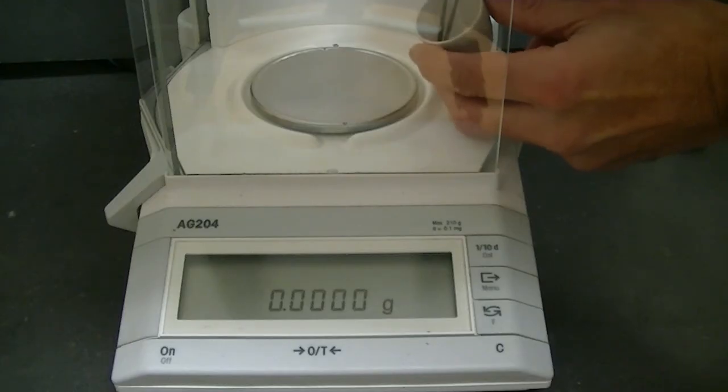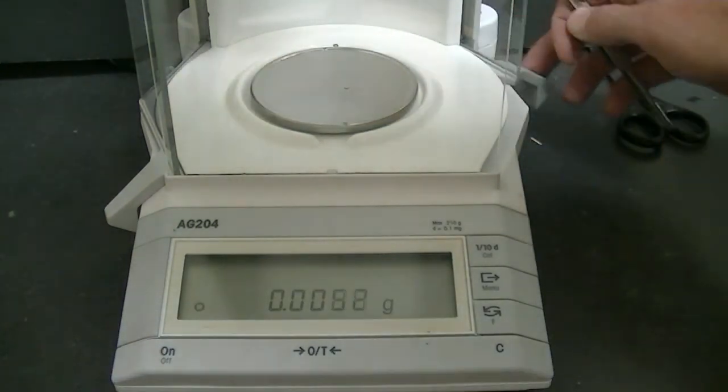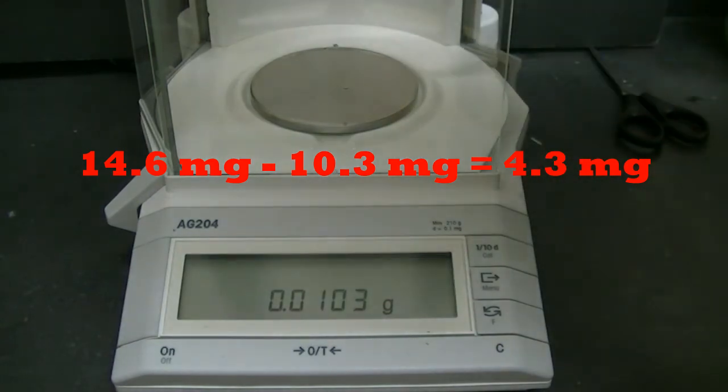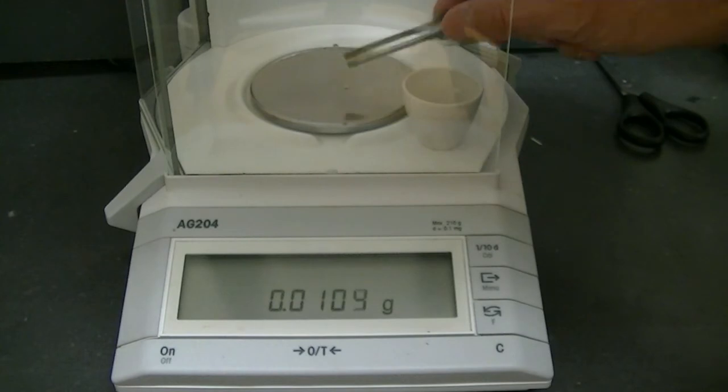Once again, we'll weigh the diamond to find out how much was converted to carbon dioxide. Remember, at the start, the diamond had a mass of 14.6 milligrams. Holy cow, that's a lot of mass lost — we're down to 10.3 milligrams. That's a total of 4.3 milligrams lost, or almost 30% of the mass of the diamond from the beginning.